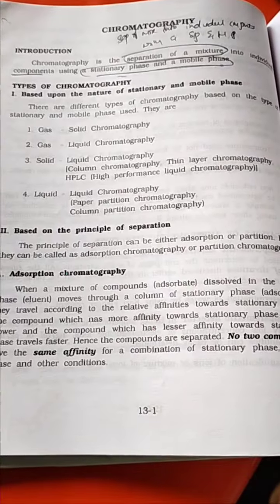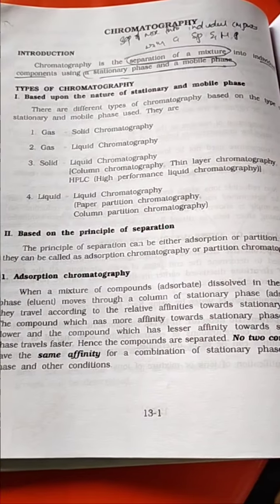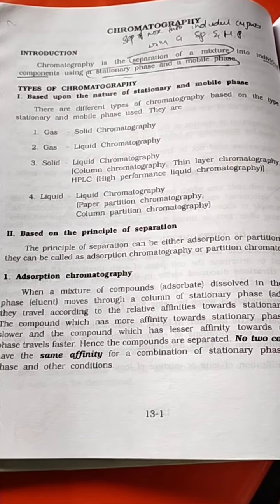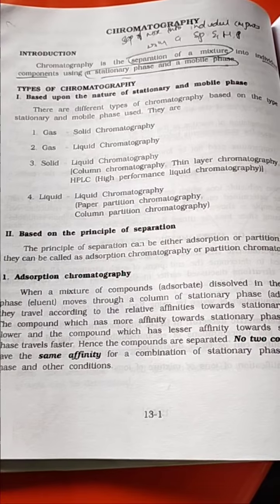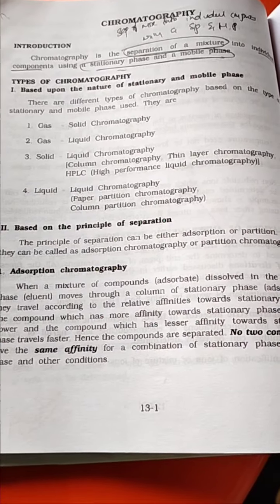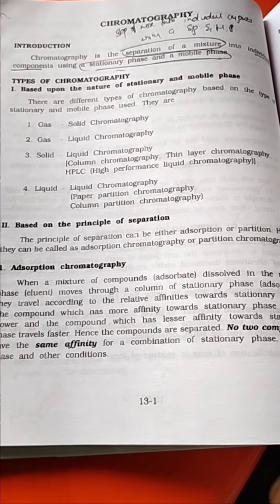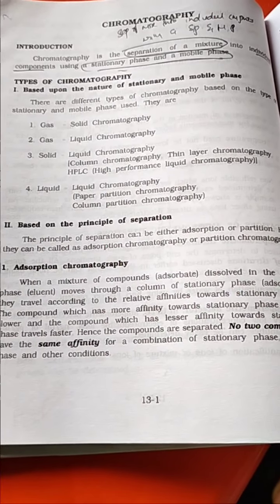Chromatography. Today's topic is chromatography. Chromatography is the separation of a mixture into individual components using a stationary phase and a mobile phase. Here we have two phases, and we separate the mixture.